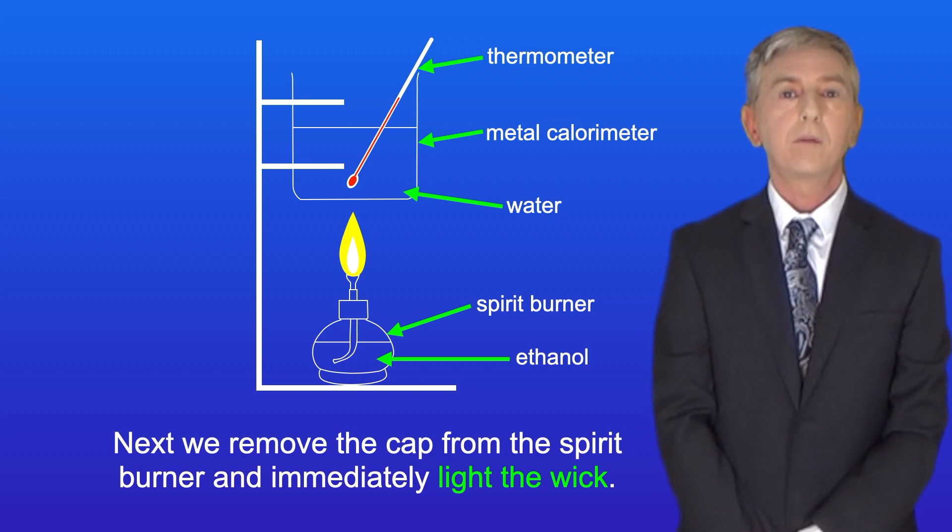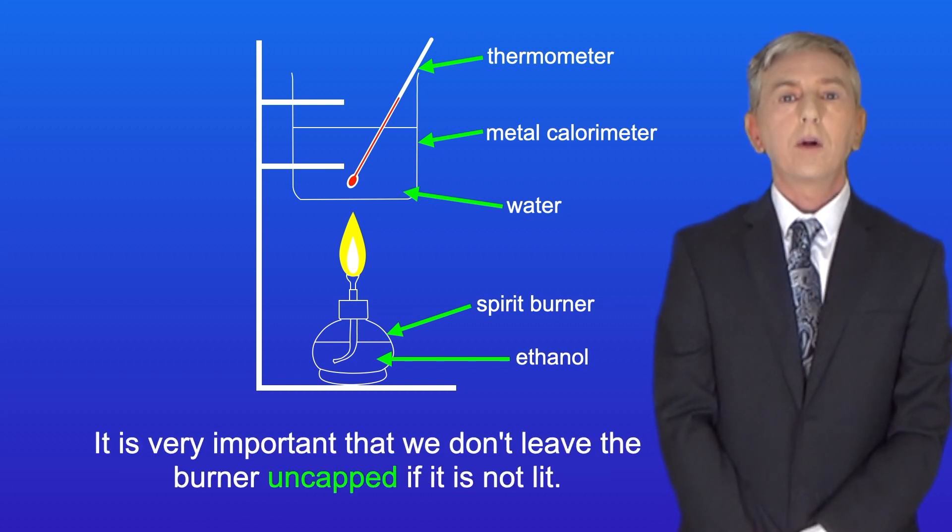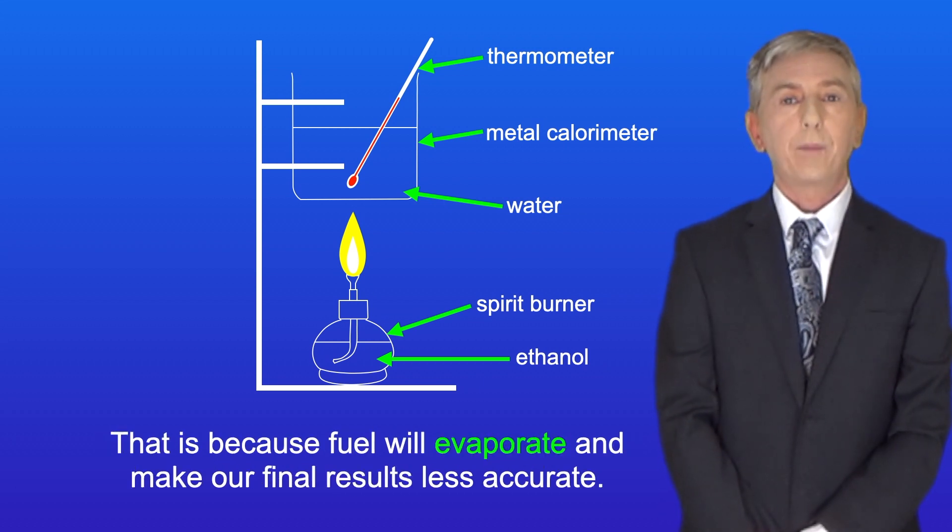Next we remove the cap from the spirit burner and immediately light the wick. It's very important that we don't leave the burner uncapped if it's not lit. That's because fuel will evaporate and make our final results less accurate.